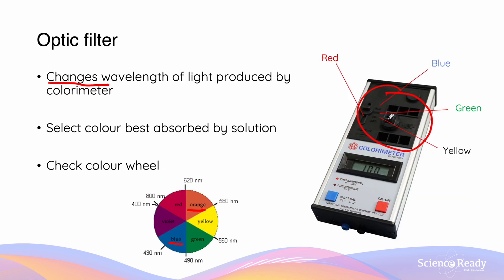Looking here, we see that the frosted faces — or in this case the waved faces — of this cuvette are facing the y-direction. This is because the light is going to be traveling through in the x-direction on the colorimeter.